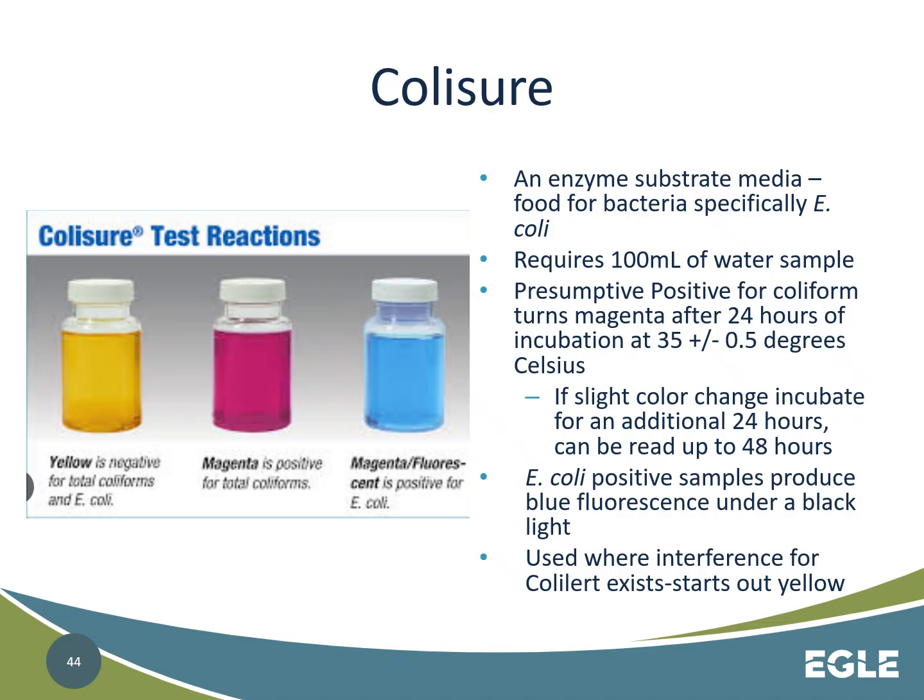Now the next one we're going to talk about is Colisure. Colisure is manufactured by the same manufacturer as Colilert, but it's created because Colilert can have interferences if you have yellow tinted water or water high in iron.